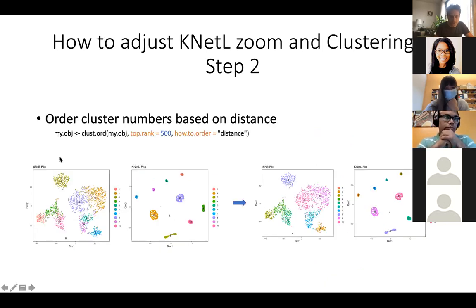we order the clusters. What that means is, for example, in here you have the T cells all in here. You have 2, 8, 5, and I guess 9 in here. And on the left, you have 1, 4, and I guess 10. And you see these are myeloid lineage. So ordering the clusters really means just to have the numbers in a consecutive order. For example, here myeloid lineage is 3, 4, and 5. They're consecutive numbers, very close to each other, right? And here you see 6, 7, 9, and 10. They're much closer to each other.